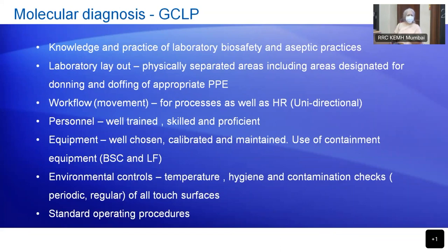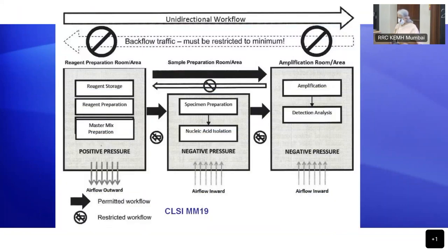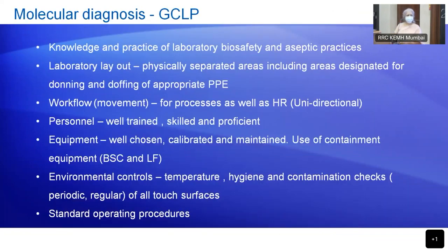Otherwise, in a routine lab, if you suspect something is contaminated, what will you do? More swab tests. The same thing you follow. Only the area is different, the equipment is different. Even the personal protective equipment you can check. So you need to take multiple samples of all the equipment you're using and all the surfaces that are being touched, either before work or after work.